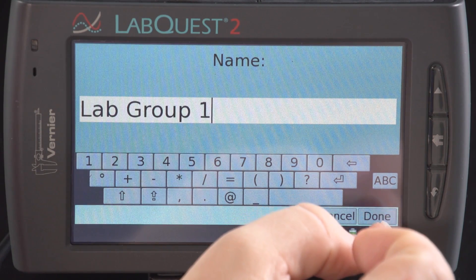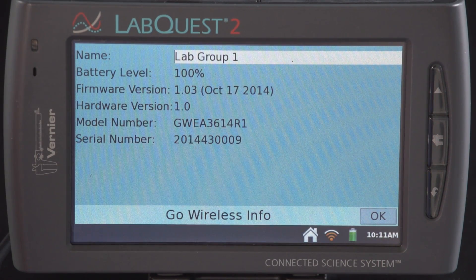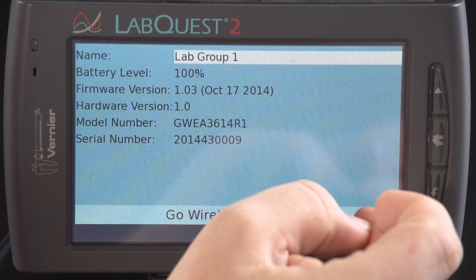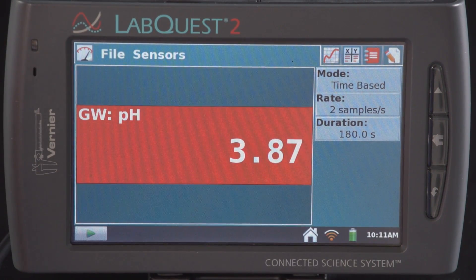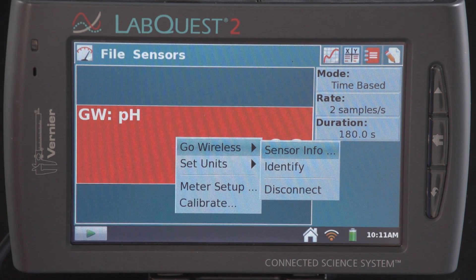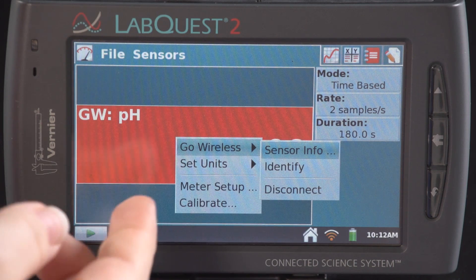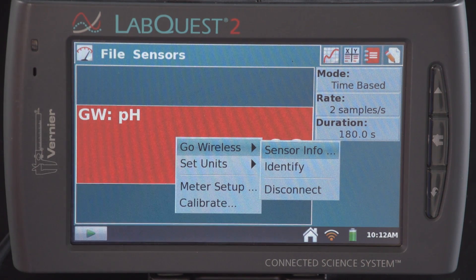When I'm done renaming, I'll select Done. This is where I can also check the battery level. Select OK to exit. Also in this Go Wireless menu, I can tap on Identify, which causes the unit you're currently connected to to blink faster. This is also where you can disconnect properly from the electrode. If you'd like to calibrate the electrode or change the units, you'll also do it from this menu by selecting the appropriate option.